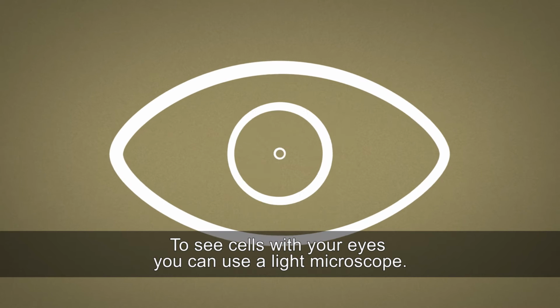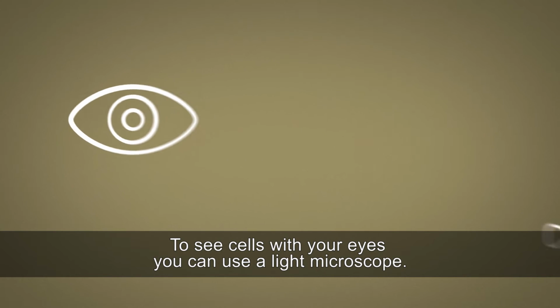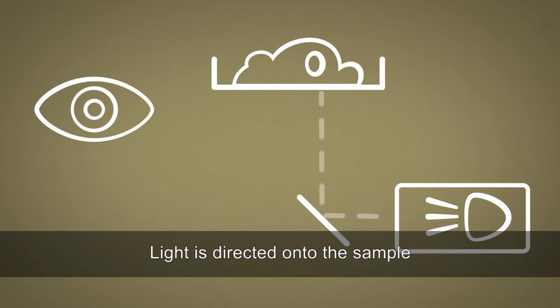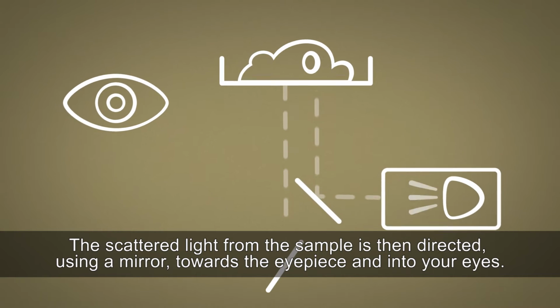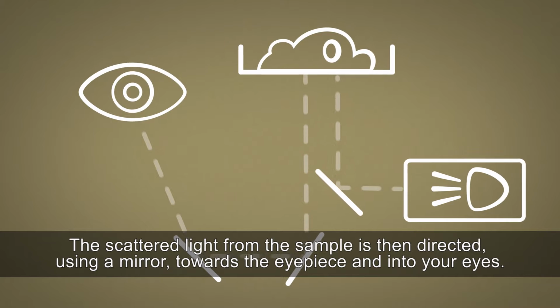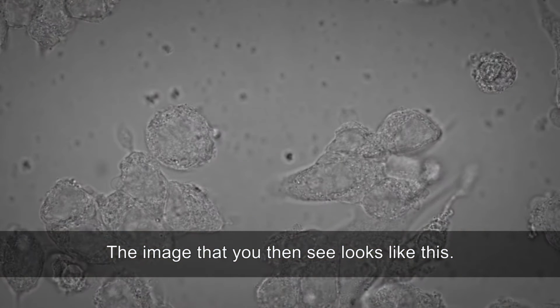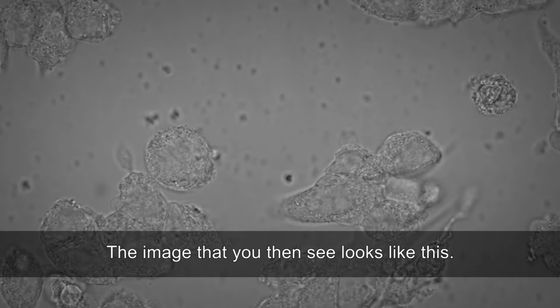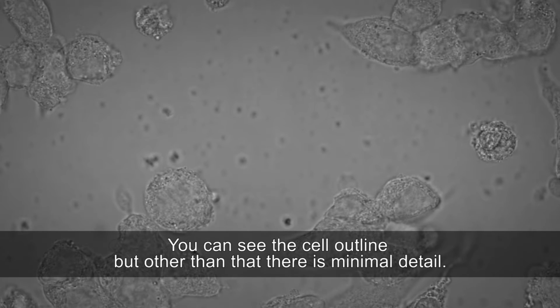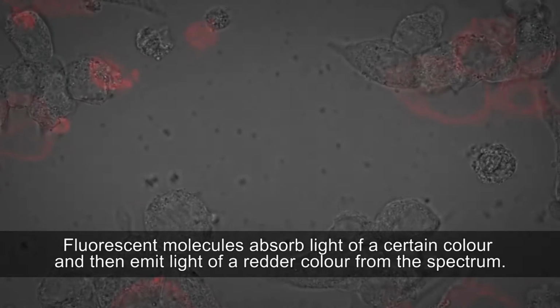To see cells with your eyes, you can use a light microscope. Light is directed onto the sample. The scattered light from the sample is then directed using a mirror towards the eyepiece and into your eyes. The image that you then see looks like this. You can see the cell outline, but other than that, there is minimal detail.